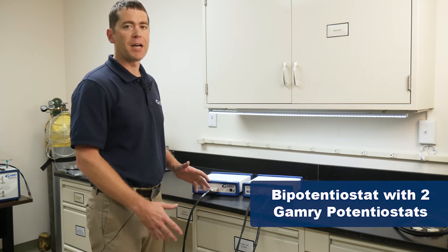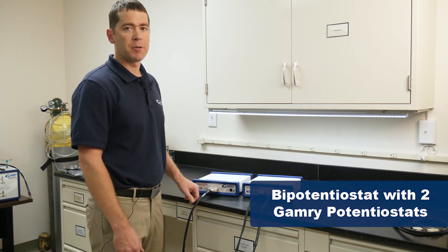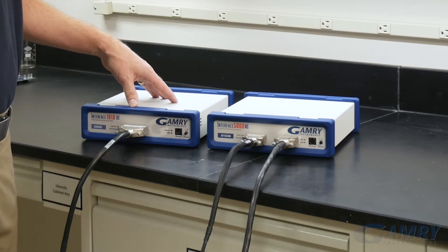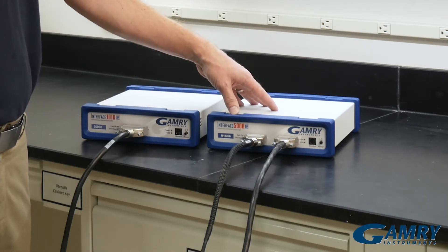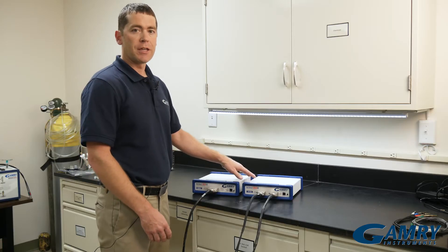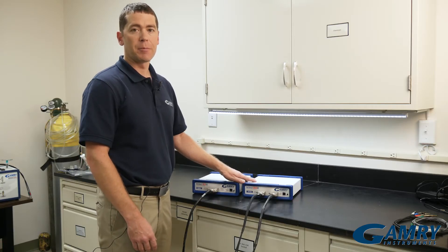Hello, I'm Chris Beasley, and I'm from Gamry Instruments. Today I want to show you how easy it is to make a bipotentiostat with two Gamry potentiostats. I have an Interface 1010E and an Interface 5000E here, both from the same instrument family, and what I can do is synchronize these two to create a bipotentiostat.